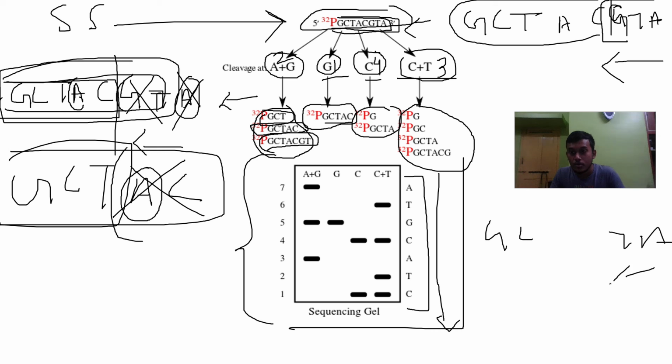So we are using from the right hand order, which is ATG CATCG. So we are using it in the right hand order to make sure of this. Alright, we are not counting G because G is the 0th or the 1st base, so it's not of much importance, the first base, but we are taking it in the right hand. We are taking the reverse order to do this. So according to the size of these DNA sequences, we are plotting the bands here.